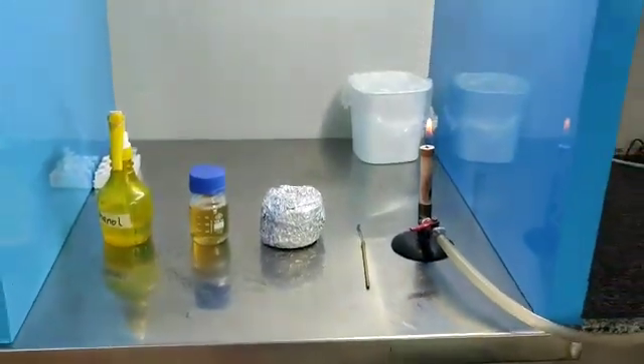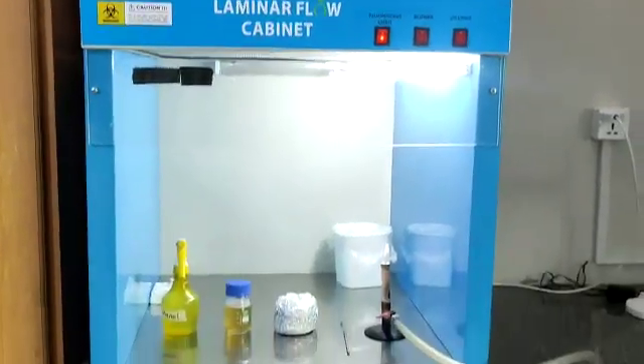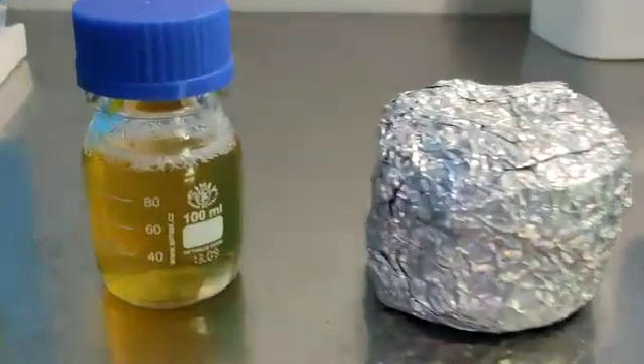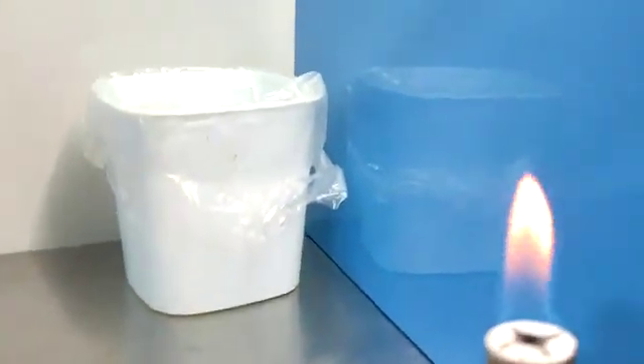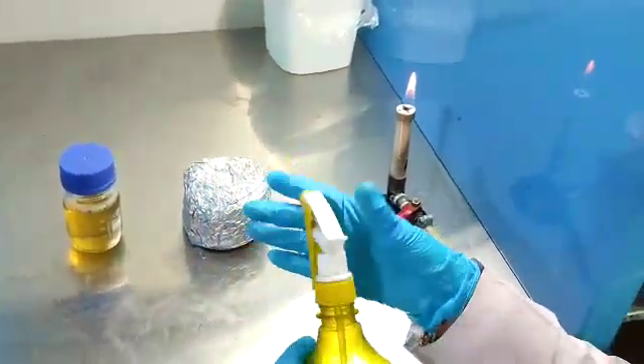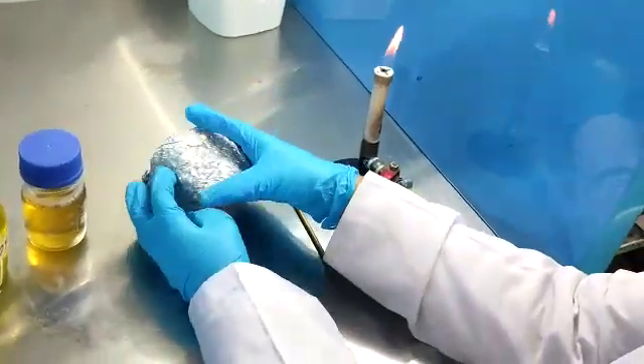Today we will learn about pouring culture; we should do it in a laminar flow hood. Prepare autoclaved nutrient agar and autoclaved petri dishes. Keep the flame open to avoid contamination. Spray 70% ethanol on your hands to kill any microbes, then open the petri dishes inside the hood.